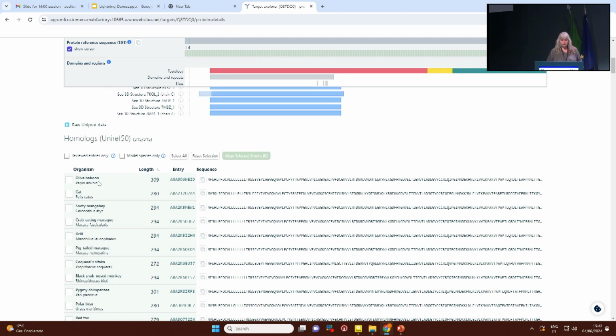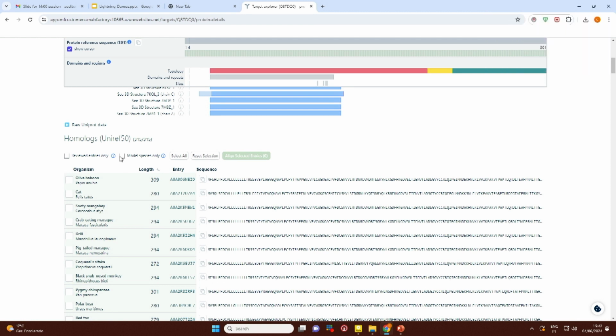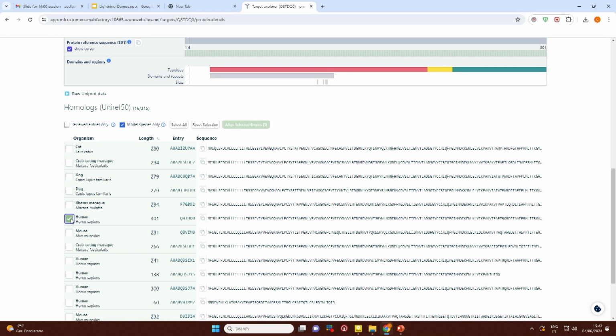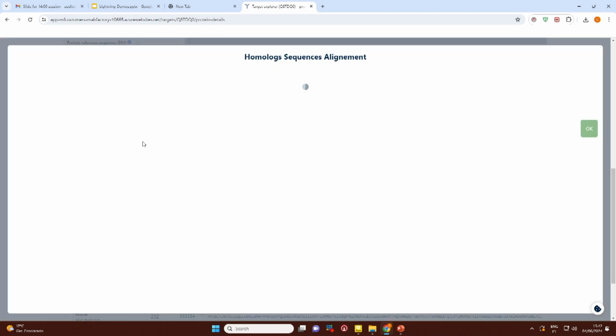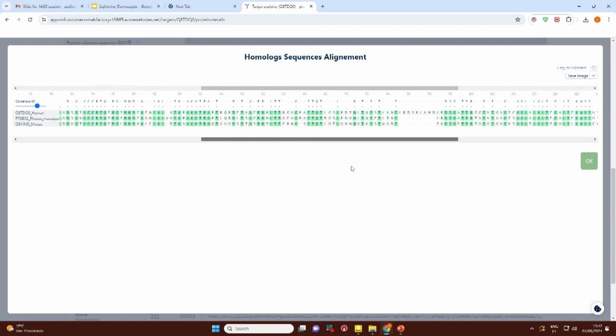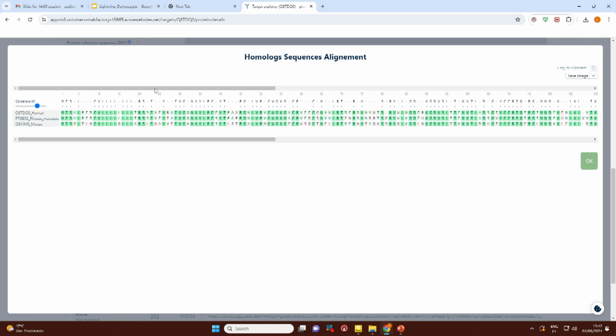And also down here you have the orthologs, because very often you would like to have an antibody that is cross-specific with, for example, cyno, so you can test it in animals, and preferably also with mice, would be nice. So you can just select different species there and align them, and see where these proteins are different between the different species and where they are similar.